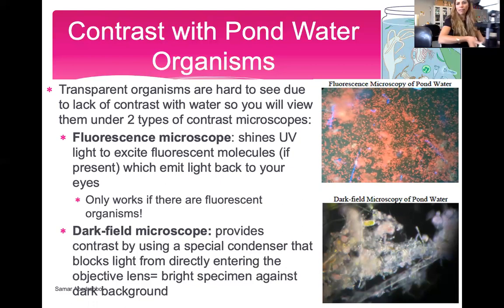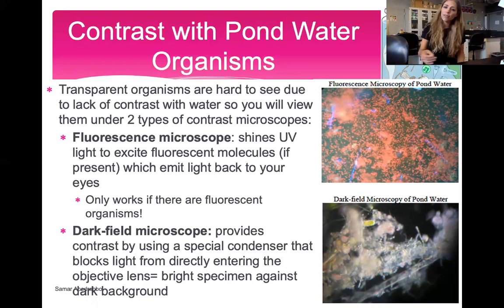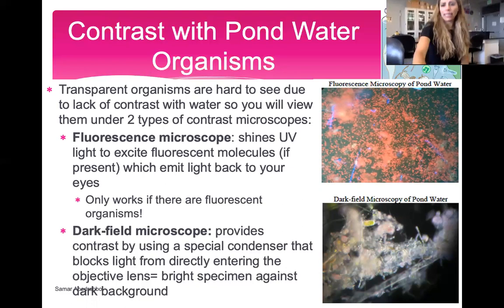I don't want to focus too much on this because I talk about it in the microscope lecture. So here is my microscope. Let me just make this a little bit bigger. Okay, so here's the microscope. There's a condenser in the microscope. We can put a dark disc in there, and that's how you get dark field microscopy. It's very easy, and you get these really nice images.